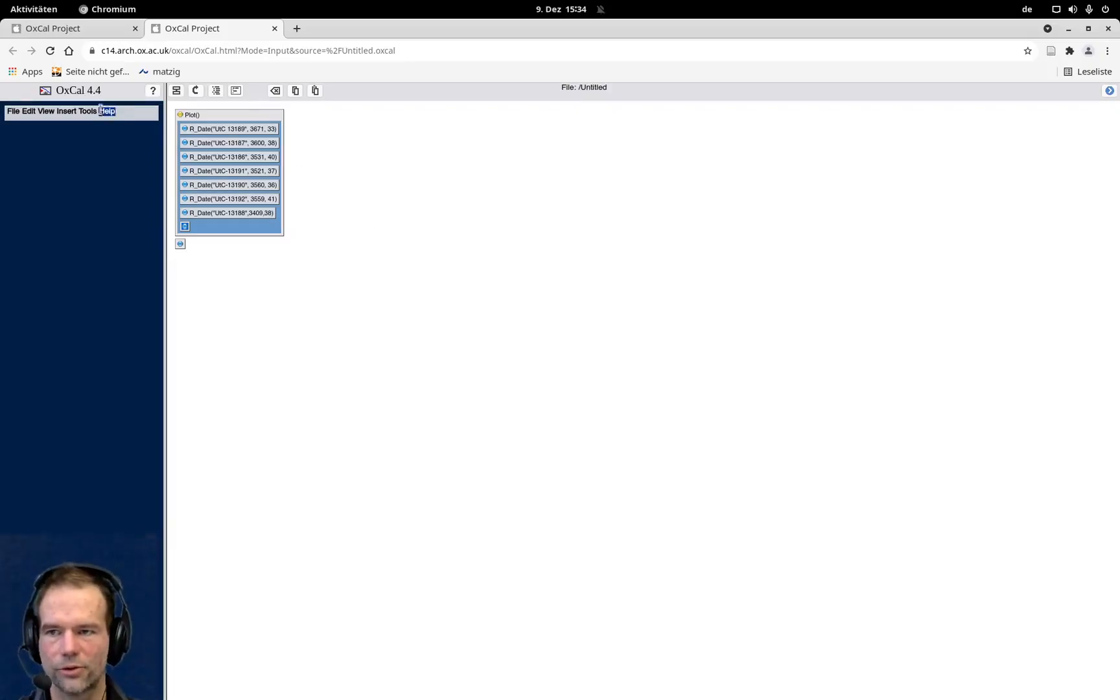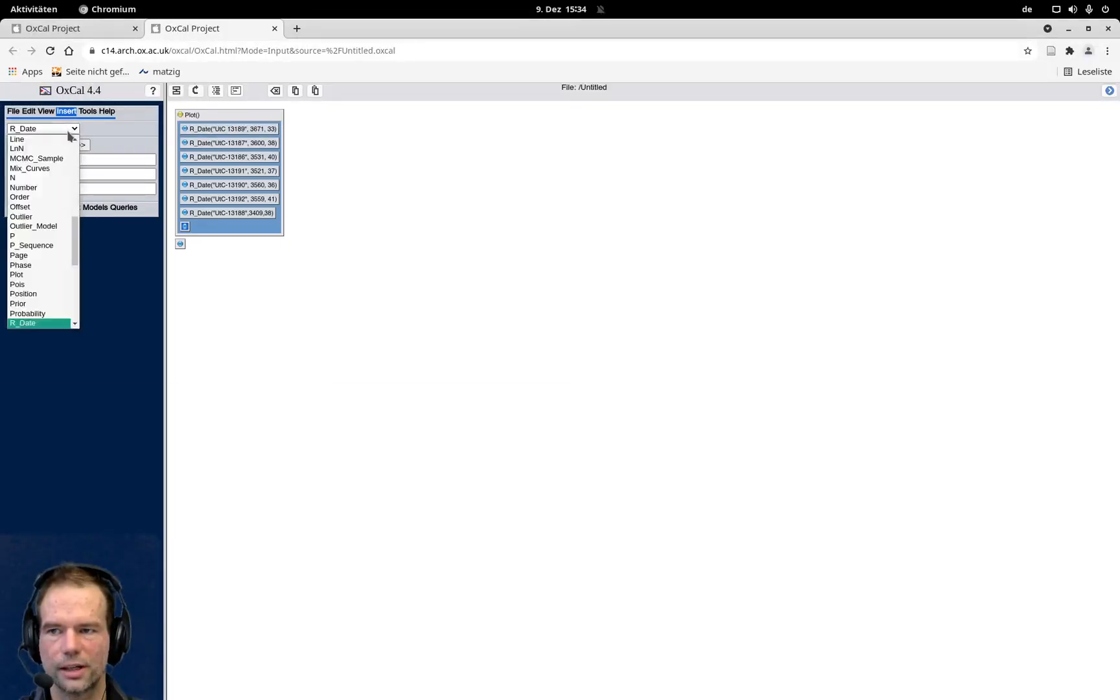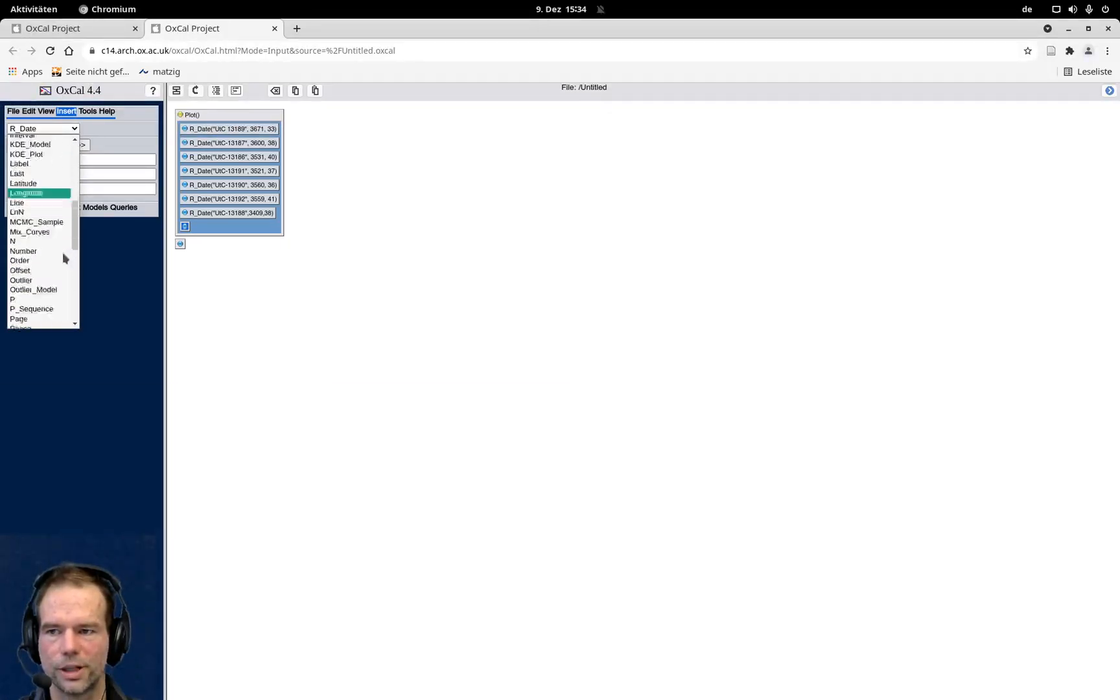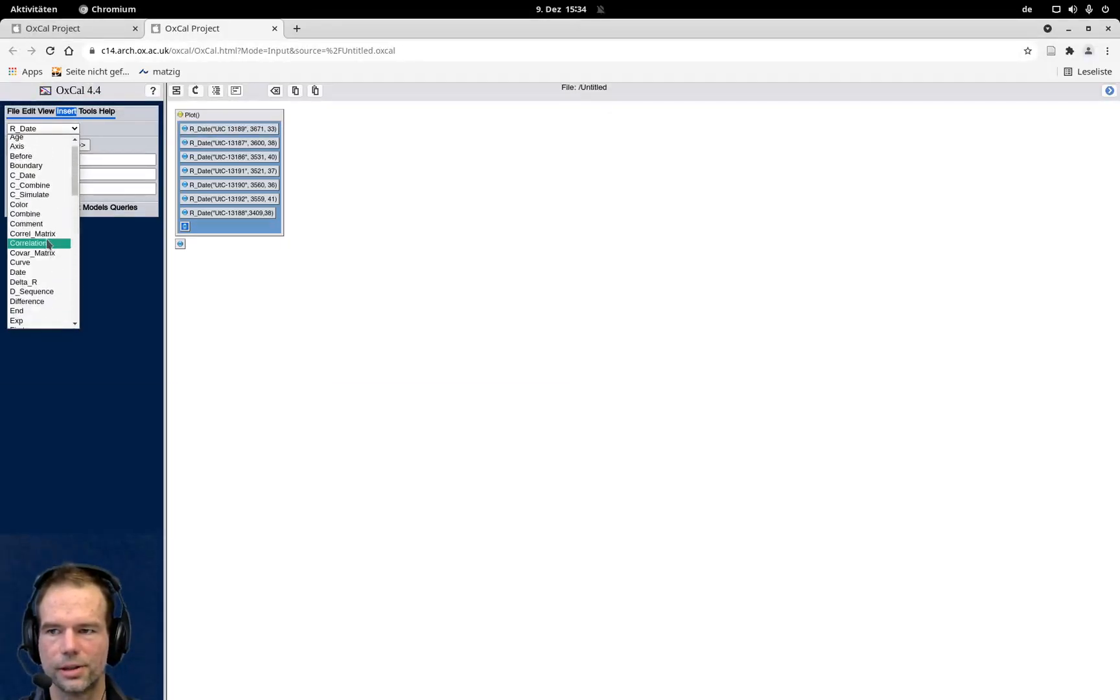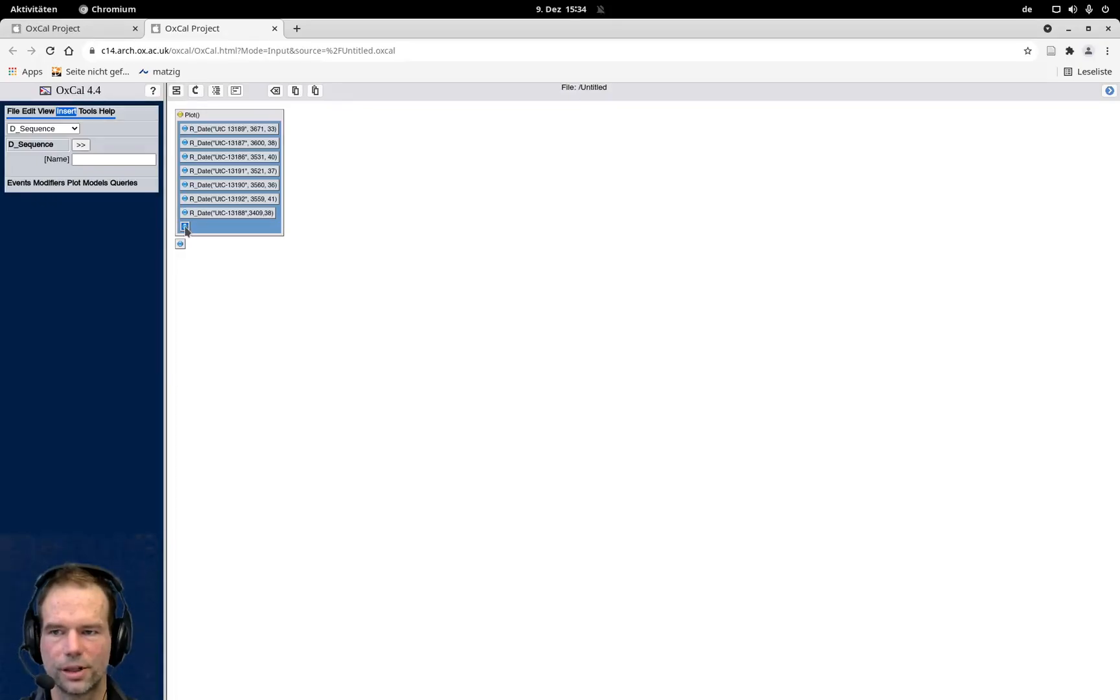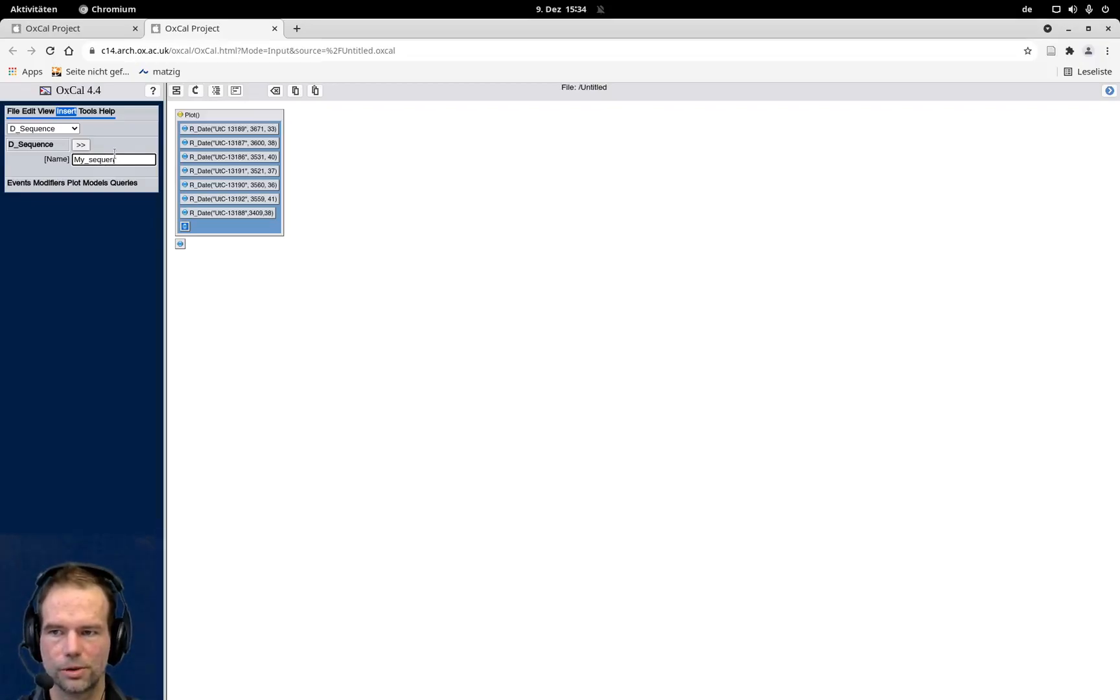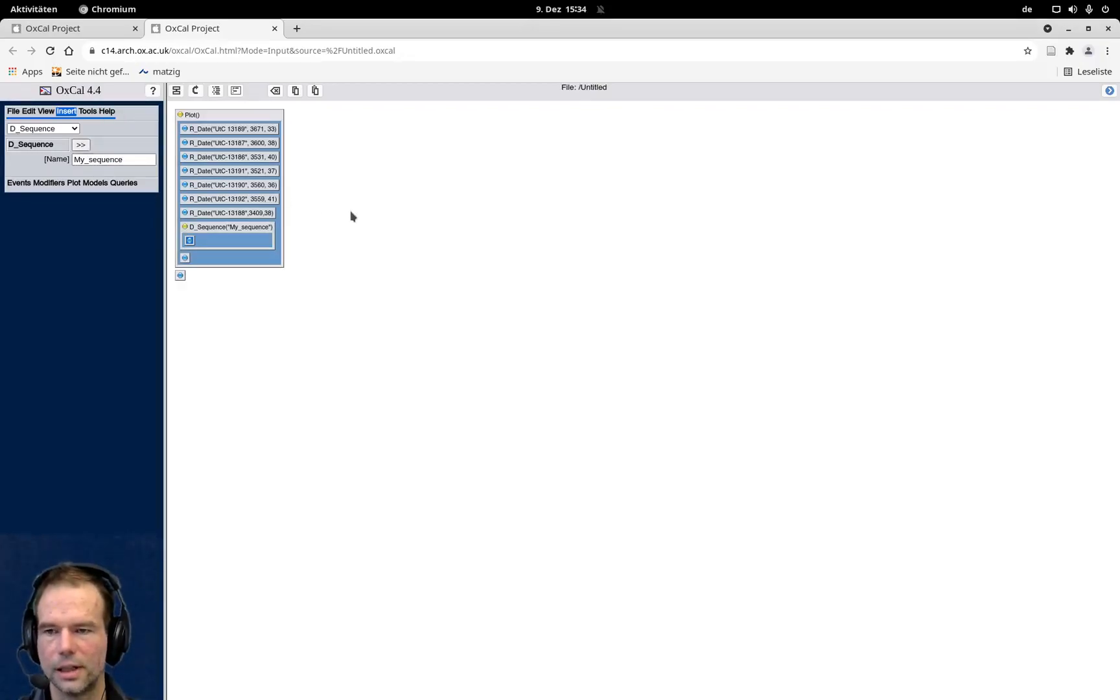To insert this, I click on insert and I select from this huge range of possibilities the d-sequence here. I highlight the specific point here that's empty, and I call that my sequence, which is probably not the most elegant name, but it will work for us.